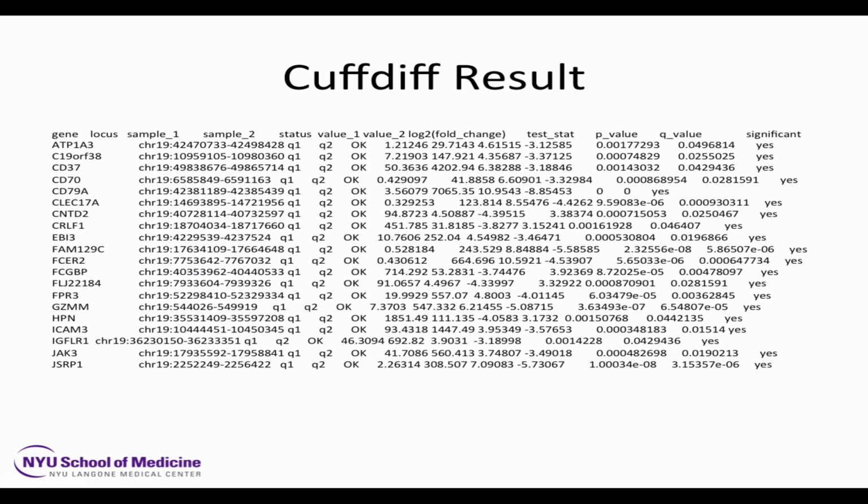I don't know what to say about what you should expect. Obviously, it totally depends on the samples that you submit. Different cell types will give you big differences. Lots of genes will be differentially expressed. Cultured cells with a single gene knockout may have very tiny number of differentially expressed genes. The gene you've knocked out and whatever's directly downstream from it ought to show some differential expression. So in this case, you're submitting 2 samples.